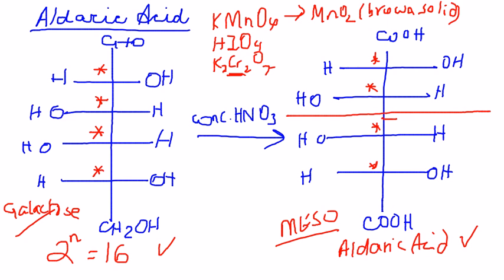So what happens in this case? What happens to HNO3 when the oxidation takes place? You reduce that to 2NO and 2H2O. Now you might wonder, well, NO is a colorless gas, but as you will read through the procedure, you will see that brown fumes appear. So what are the brown fumes due to? Let's take a look at the procedure and discuss that as well.